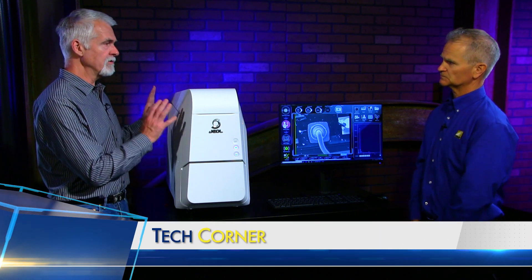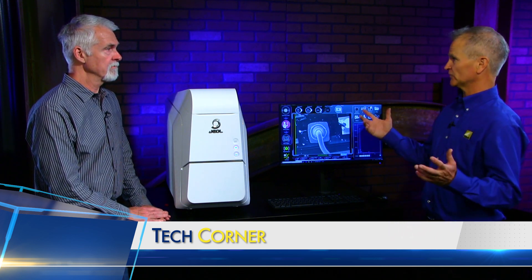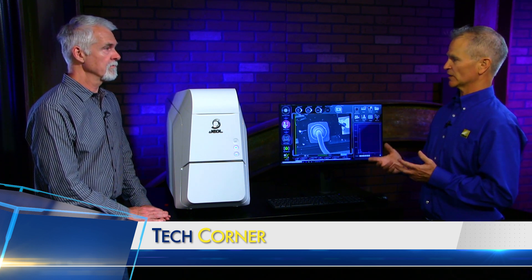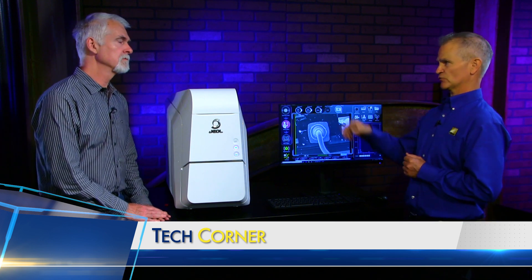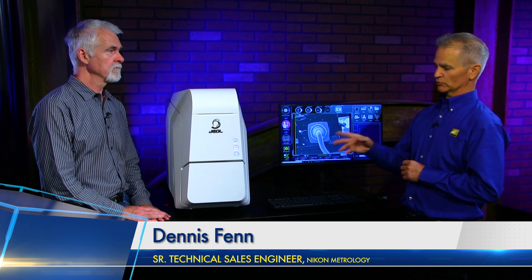Who's mostly using this type of equipment? A wide range of industries. We sell a lot of these even to customers that have a full-size SEM. But there may be a lab in some other building and the engineer wants to get his parts back right away, but it takes three or four weeks. Or even they have to send the sample out to a testing house. So this is a very inexpensive unit to have — an engineer or researcher can put it on their table.